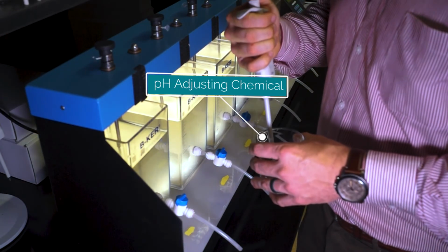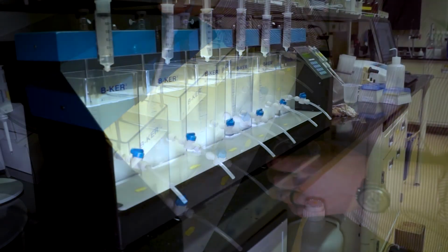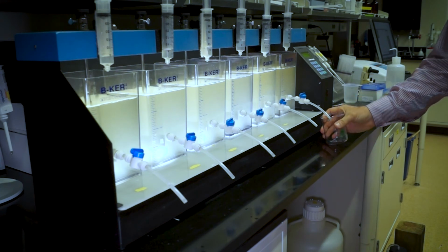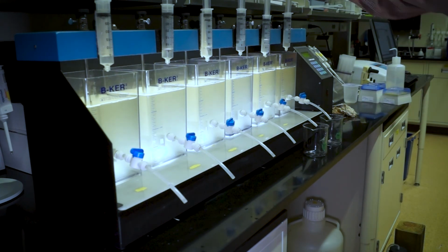Next, we will add the volume of acid or base determined in the titration step to its corresponding jar. Prior to starting the jar test, place a beaker at each jar, which will be used to collect post-coagulation pH samples at the end of rapid mix.